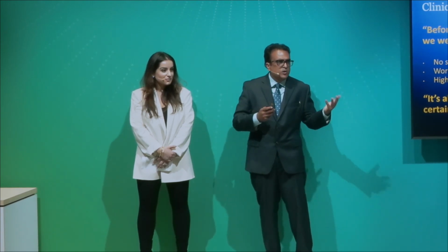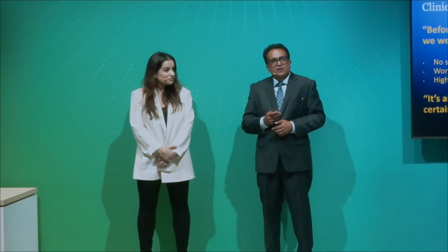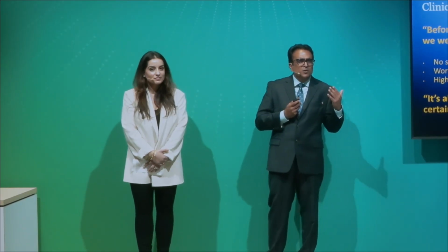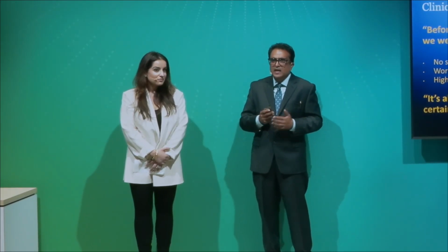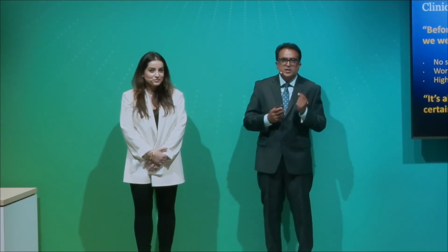It's already been 2 hours. I need that troponin result. This patient's having an MI. If you know anything about it, the previous speaker spoke about MI and cardiac syndrome. If you're that late with it, not only are you at compliance risk, you're also at risk of losing a patient's life. I took an oath to those patients. So every one of those samples is near and dear to my heart.